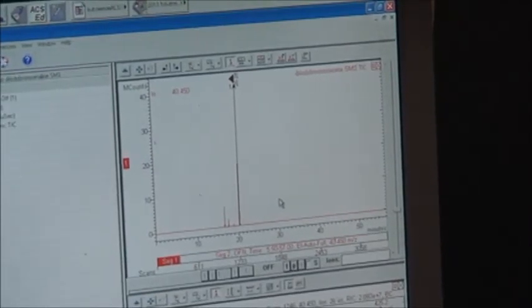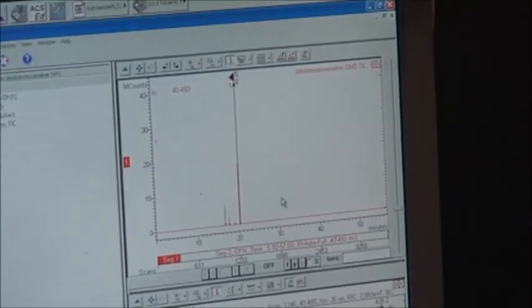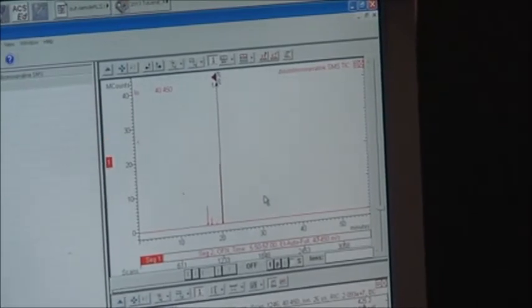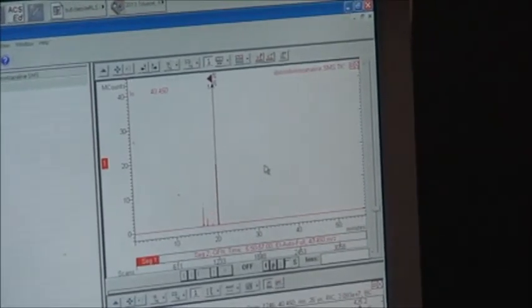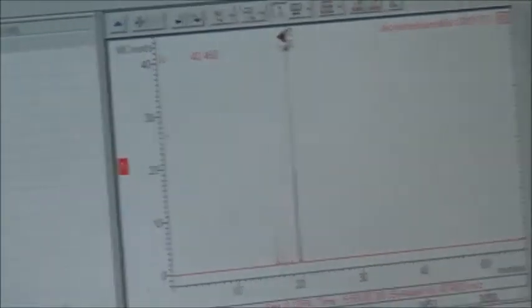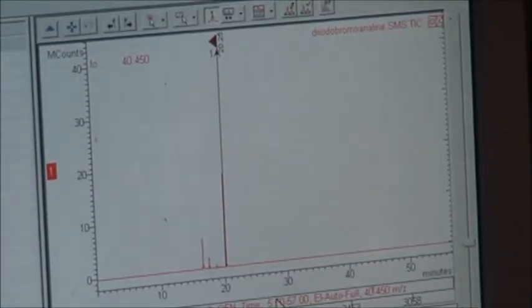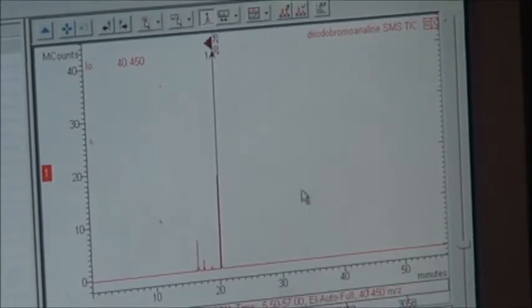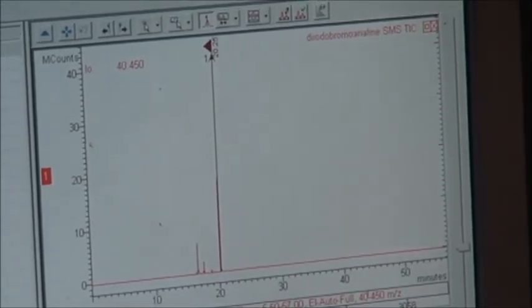The sample represented by this graphical data is para-bromoaniline. The top represents the GC component of the spectrum. It basically represents retention time, which shows you at what time the separation occurred for each component.